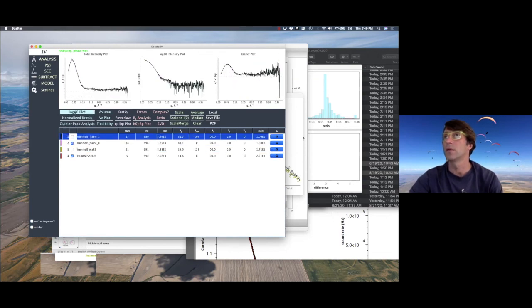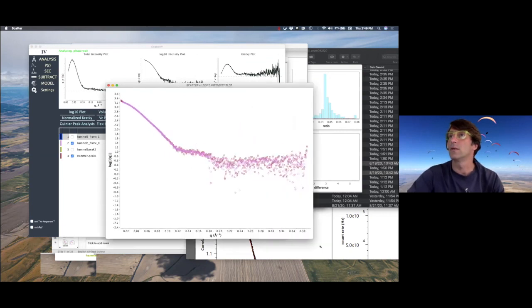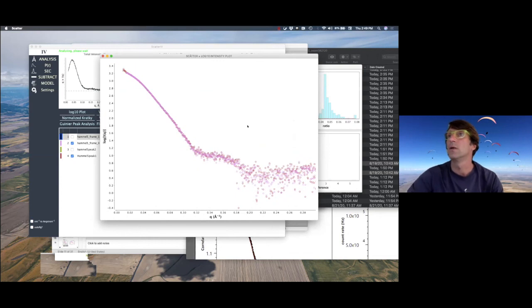Okay, I'm going to show it again. This is it. Those are SVD versus just simple merging. So obviously, it's just the longer tail of a larger particle overlapping with the small particles. Anyway, this was very advanced.